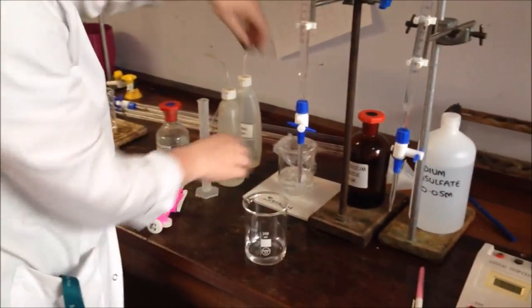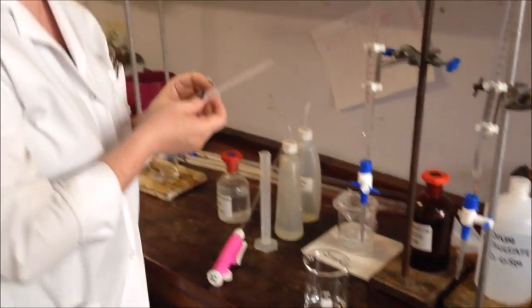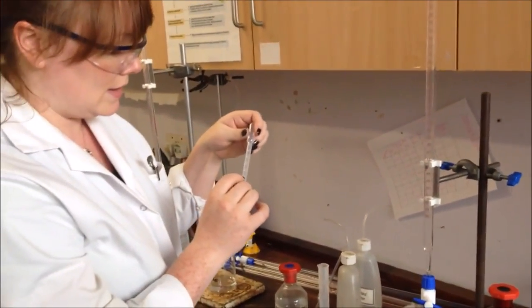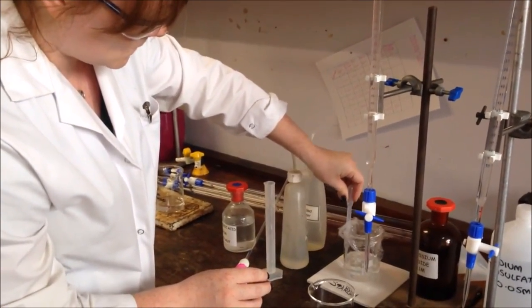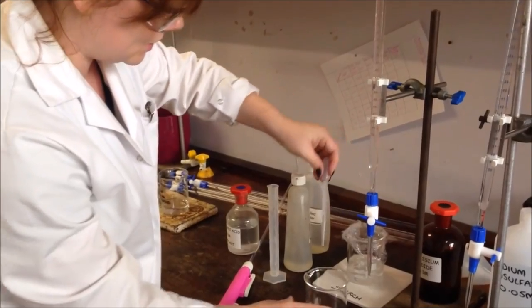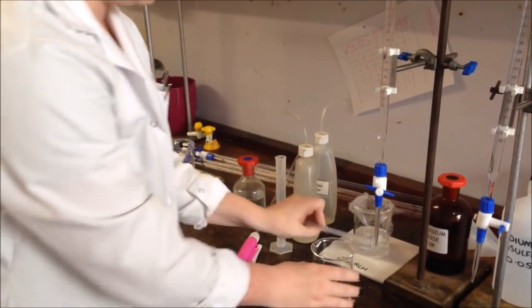I now need to add 1cm³ of starch, and I'm just going to be doing that with a little dropping pipette. You'll see that I have 0.5 and 1 on the side here, so that's up to 1cm³. That can go in there now.